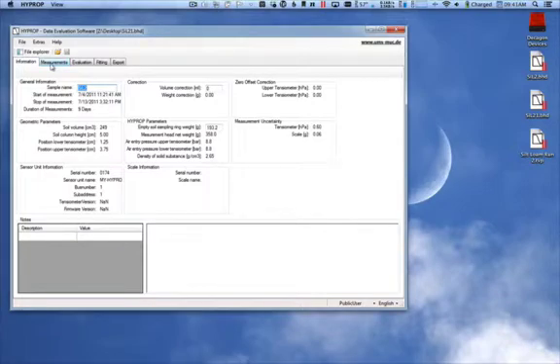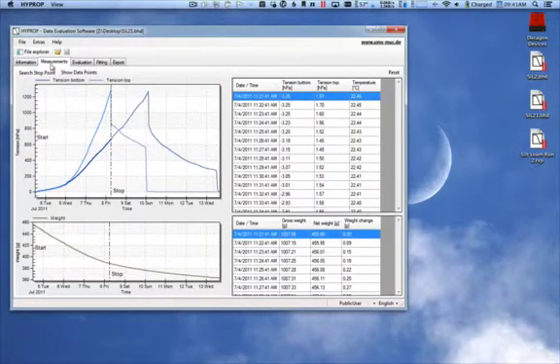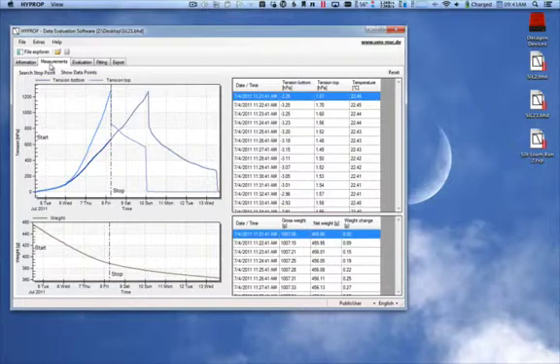In the Measurements tab, we can use the air entry point of the ceramic to get an additional data point between 600 and 800 hectopascals.